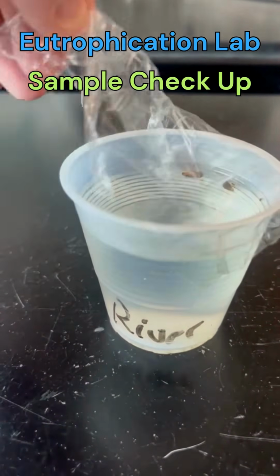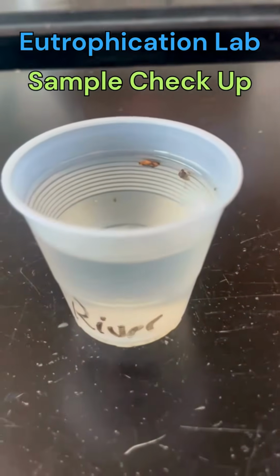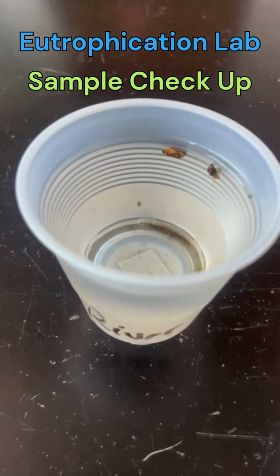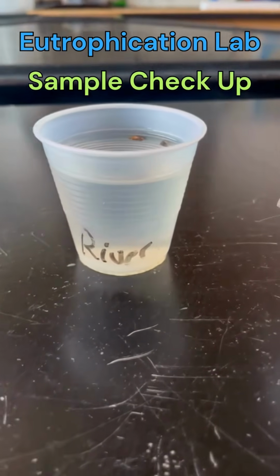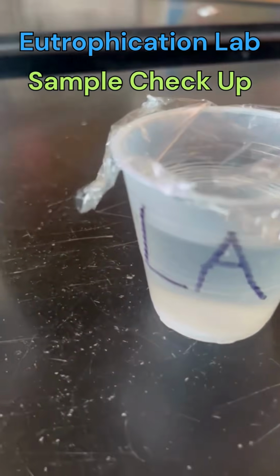The river was a little different. It was definitely discolored. It was more yellow in terms of the change of color, and there was, under the microscope, definitely some eutrophication and algae growth.